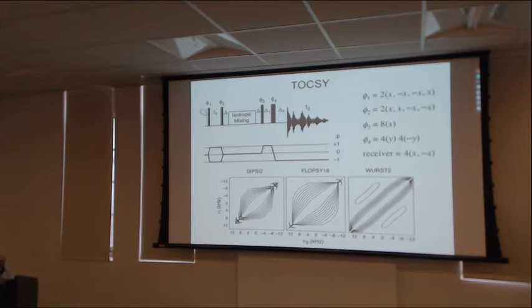So here's a 90-degree pulse, followed by a T1 evolution period. That's simply to let the chemical shift evolve, so we have the spin frequencies in the first dimension. And of course, the scalar coupling will evolve too. That's not particularly interesting.